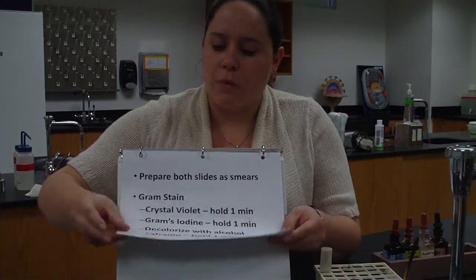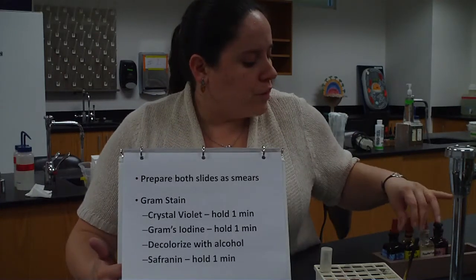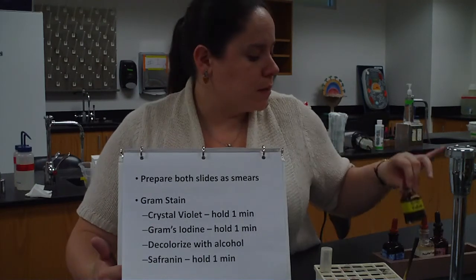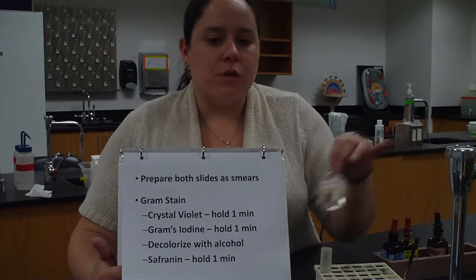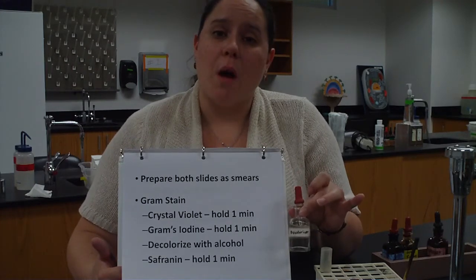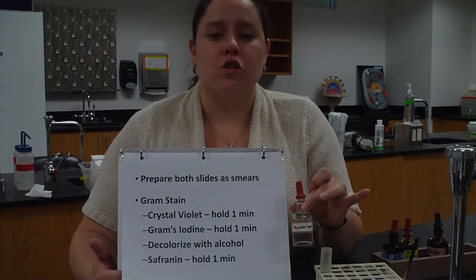We would then have gram's iodine. Hold on one second. So here's our crystal violet, just in case you want to see what that looks like. Then after rinsing with water, you would flood with your gram's iodine. Hold that on your slide for 1 minute. Then after rinsing your gram's iodine with water, you would then get to the decolorizing step where you would use the alcohol acetone mix. I always say that you use this drop-wise. We're not going to flood the slide. We're not going to hold it for a minute. This is drop-wise, and I'll show you how to do that in just a second.